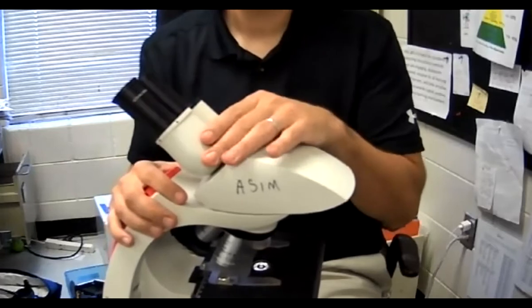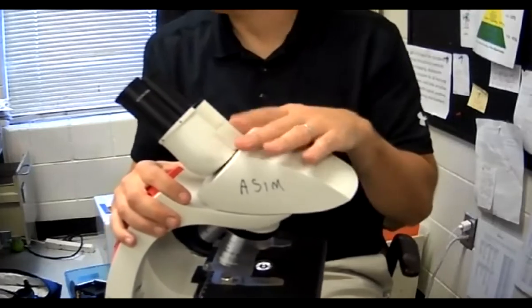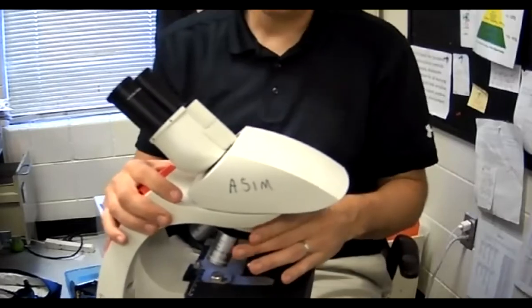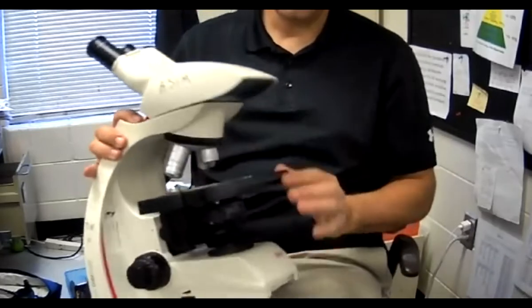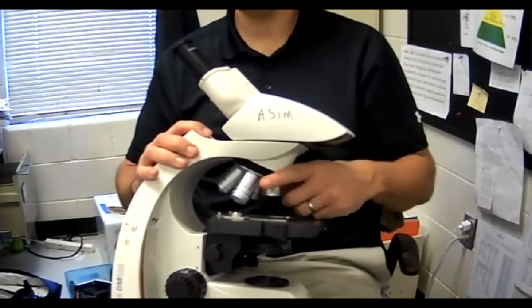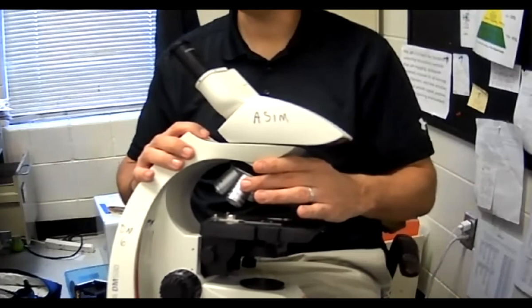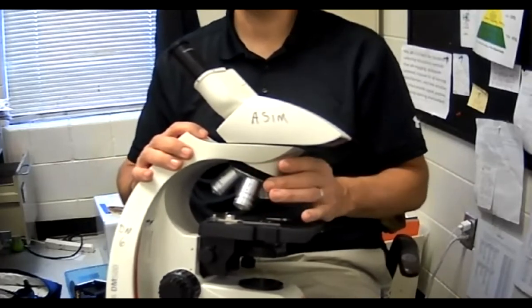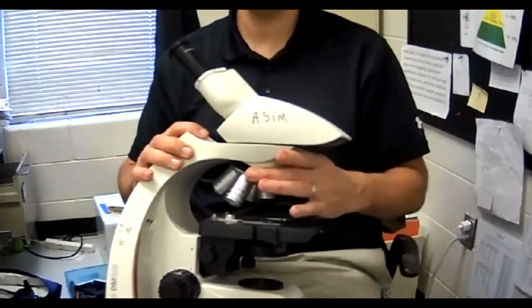So we have the eyepiece and the body tube. This next part right here — these four — what are these called? Does anybody remember what these are called? We did our notes on them yesterday. They're called the objective lenses.